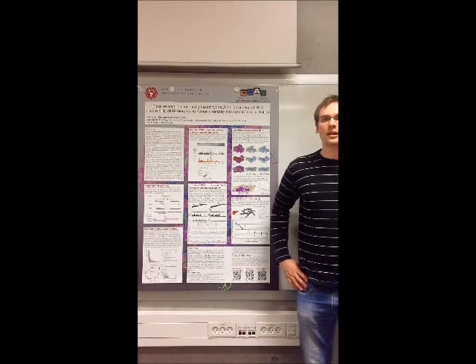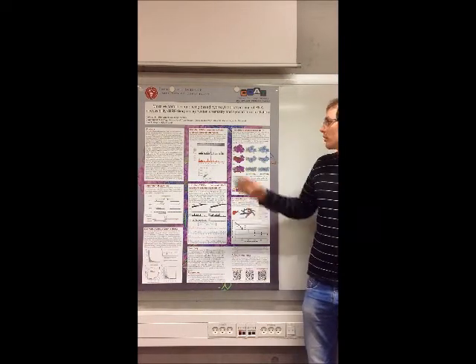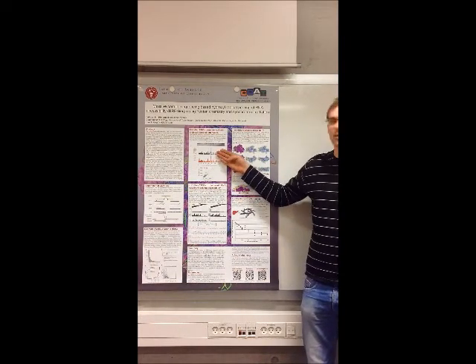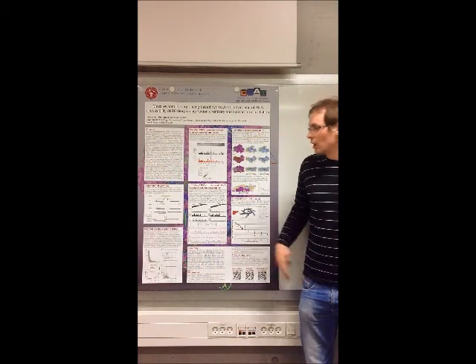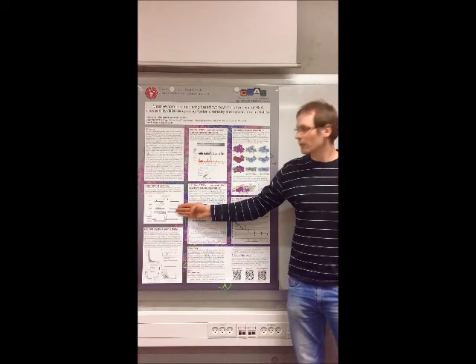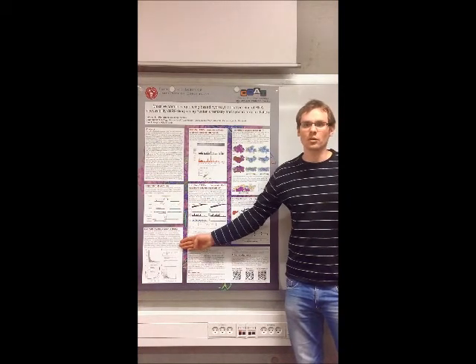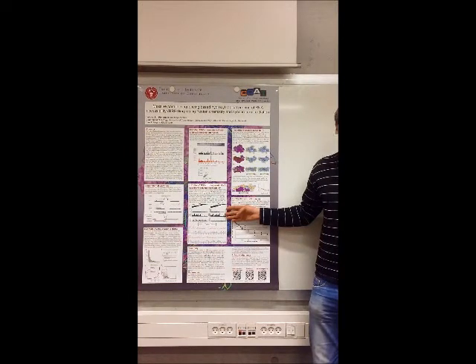We have shown that HRF-Seq readout agrees well both with the traditional method of hydroxyl radical signal detection as well as with the RNA backbone accessibility. To achieve that, we modified our experimental workflow, introduced the EUC concept, and proposed a normalization scheme.